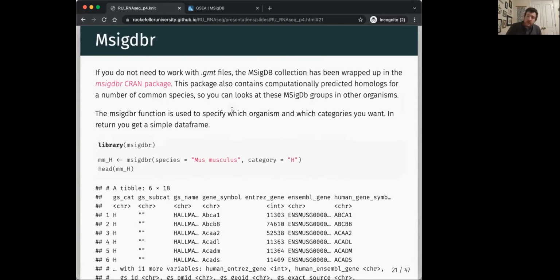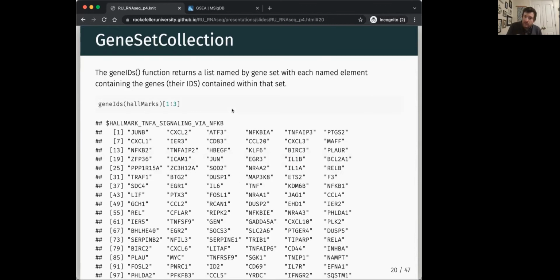And so we introduced this idea of using GSEABase, because a lot of the time, if you start working with someone and they're using MSigDB, they'll have GMT files, okay? And GMT files, you can exchange them. They may have created their own gene sets and then put them into a GMT file. It's a relatively common file format.